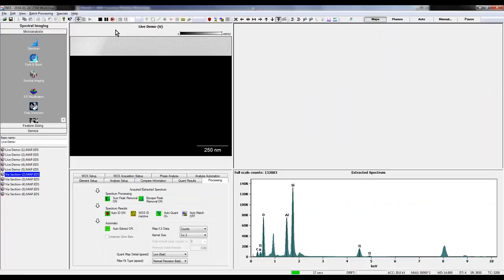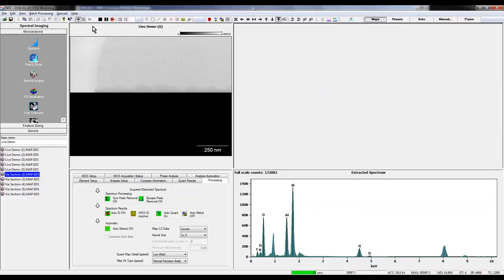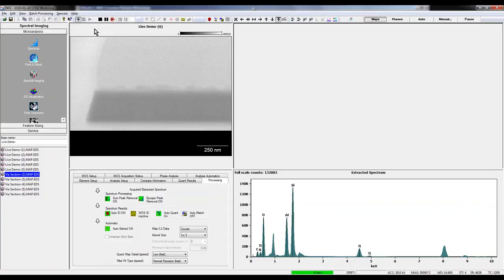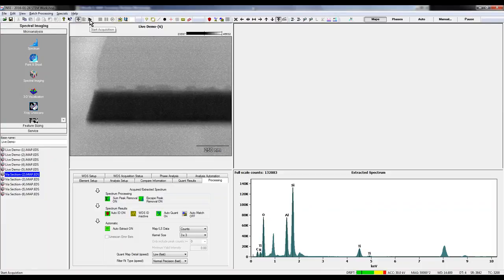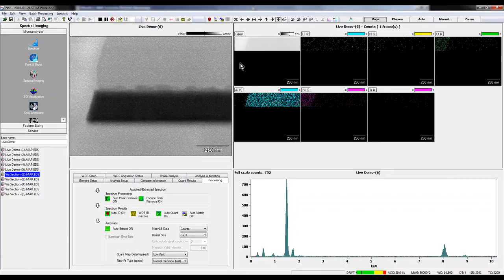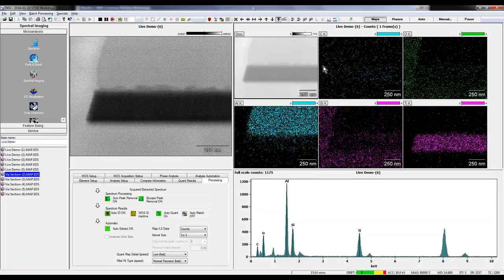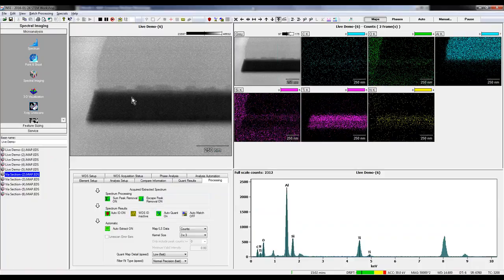acquire a map. And again, we are at a 100,000x magnification, which gives us a field of view of 1 micron. And so when you consider what the expansion of the beam would do in a bulk material, where 1 micron is a completely mixed up blur, with these thin samples, we are able to get incredible high-resolution definition out of the information here. And again, it all comes down to doing very careful mapping on the thinned samples that have been prepared by the focused ion beam. So again, in just about 30 seconds, we already have a visual idea of what's going on.